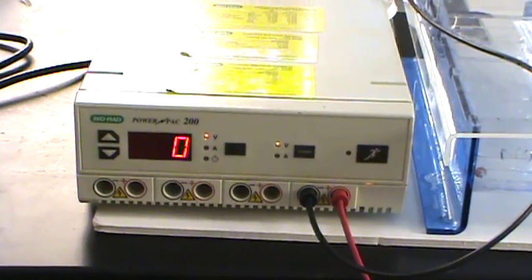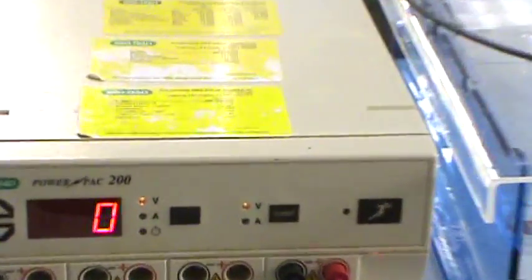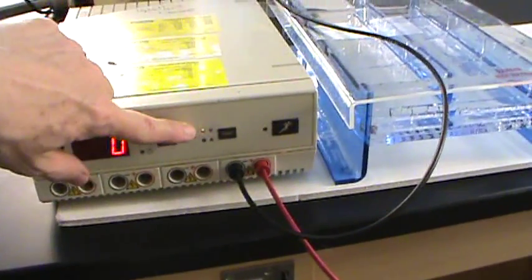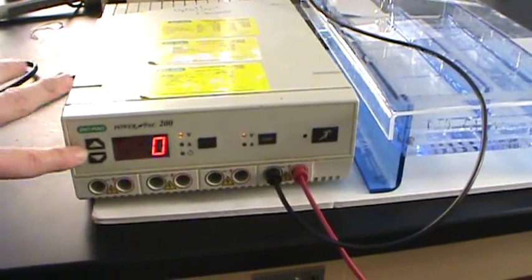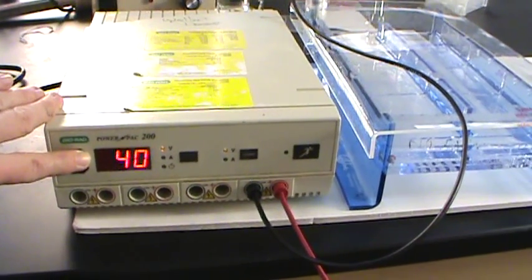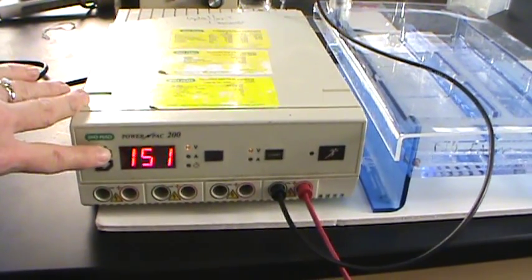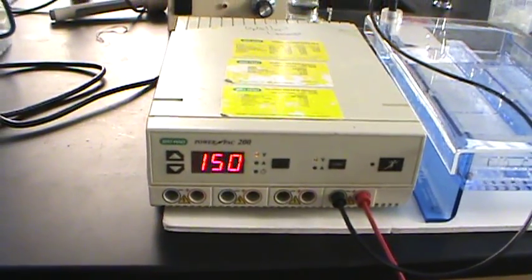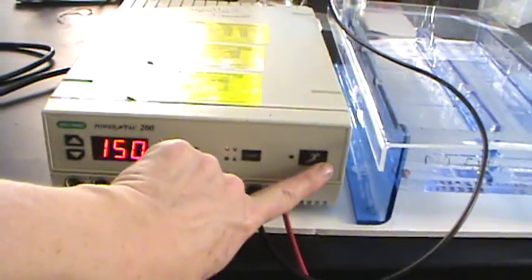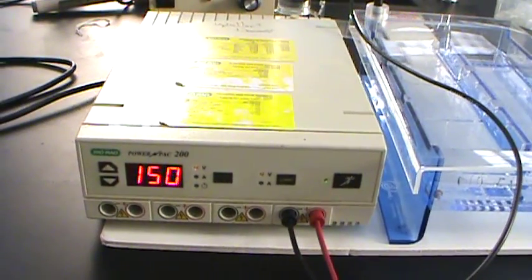Here's our electrophoresis unit. And we wanted to read voltage. So you can see here that there's a little yellow dot by a V, indicating that it's reading voltage. We also see a yellow dot here, and we're going to want to set this. And what I suggest is that we set this at 150 volts. So we're going to use the toggle arrows here to do that. And that's set on 150, but it hasn't started yet. When we want it to go, we're going to hit this little running man here, or the on button. And we should see that that should go up to 150.